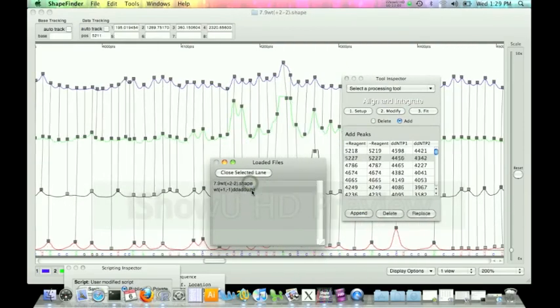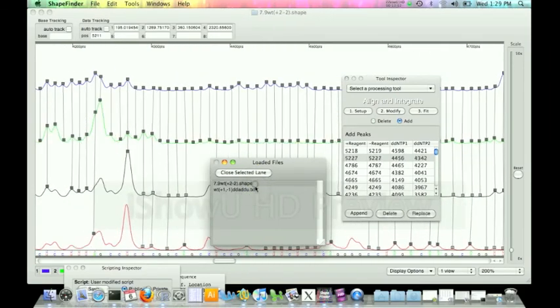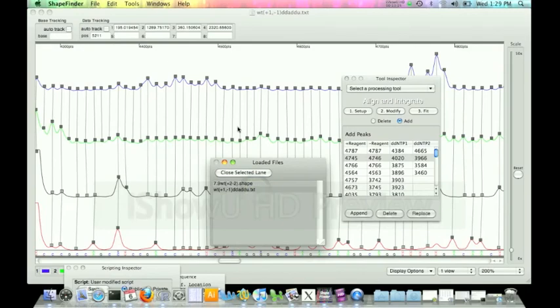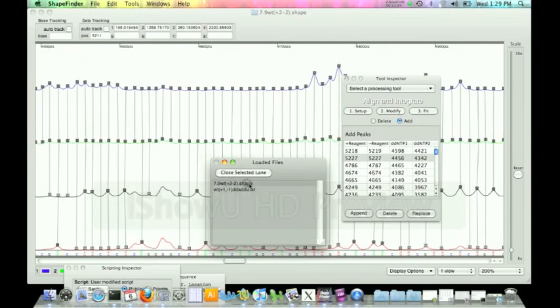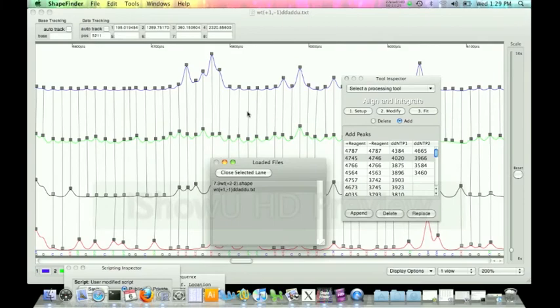This is how you get reproducible data from more than one experiment. You really need to make sure that the peaks are in the same positions between multiple experiments, even though the intensity changes. That's just general variance. We want to make sure that the peaks are in the same spots. That way each nucleotide is basically getting the same reactivity value from the same position in the data.